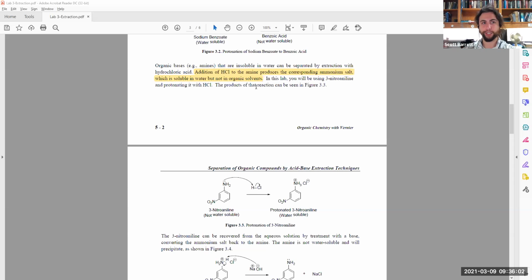So you can kind of see the direction that we're going here and what we're going to do going forward in this separation of the acid and bases. You would know firstly that the organic acid is not soluble in water, but if you put in sodium hydroxide aqueous solution of a base, then it'll become soluble. However, if you have your amine in there and the aqueous solution is very basic, then the amine wouldn't dissolve, because the amine can only dissolve when it's protonated by an acid. So you can see the two differences there.